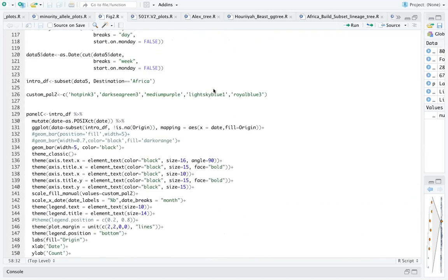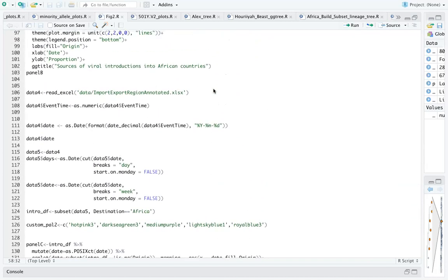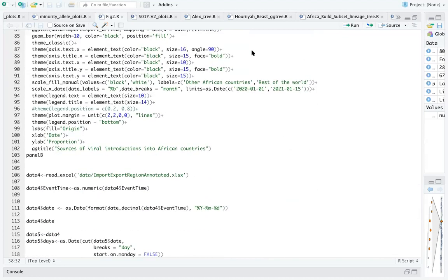So that's briefly it, but you have the scripts in the links that we shared last week, so you can feel free to go through the data as well. And now you know how to generate the input file.